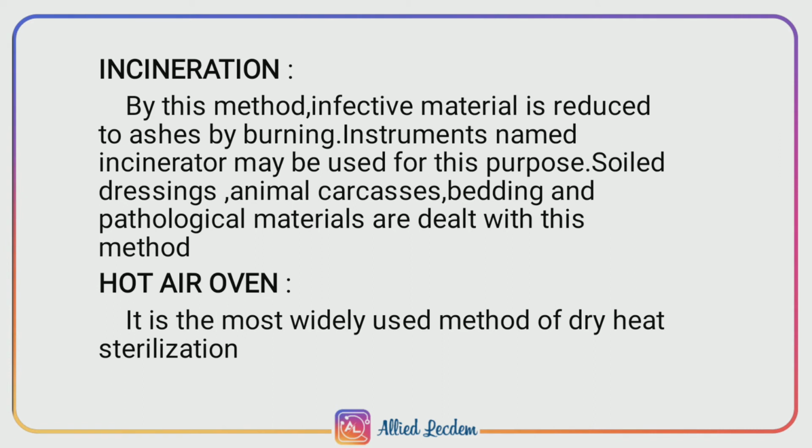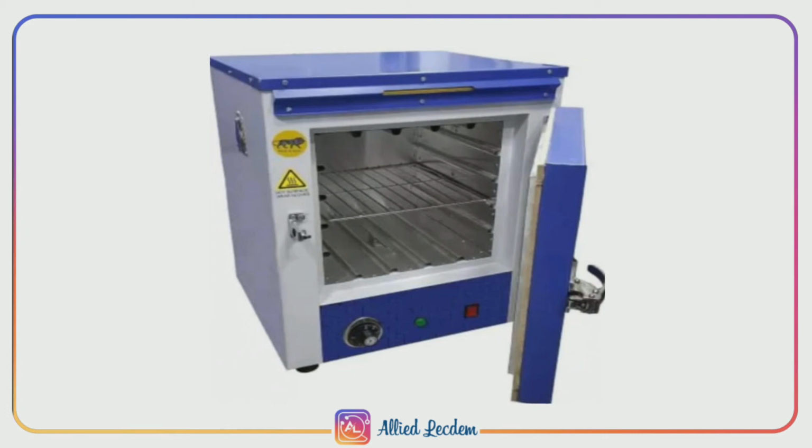Then hot air oven. It is the most widely used method of dry heat sterilization. Here comes the picture of hot air oven, which is electrically heated and thermostatically controlled, and this instrument can be used for sterilizing many laboratory glasswares.